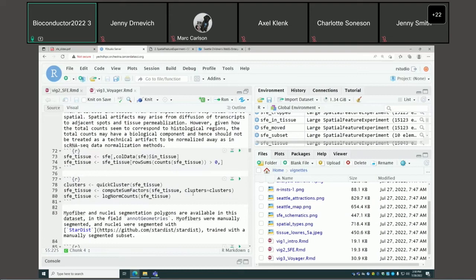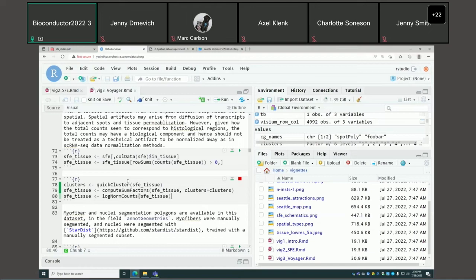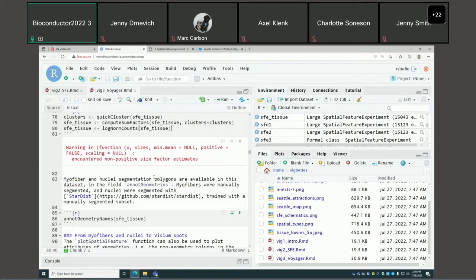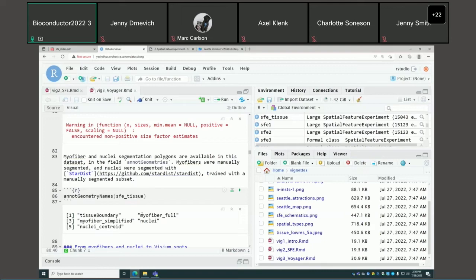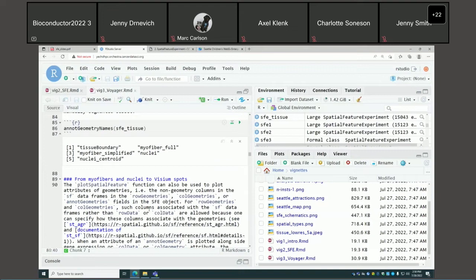We'll work only on spots that intersect the tissue. We use the scran package to normalize the data. The annotation geometries include tissue boundary, myofiber segmentation, and nuclei segmentation.